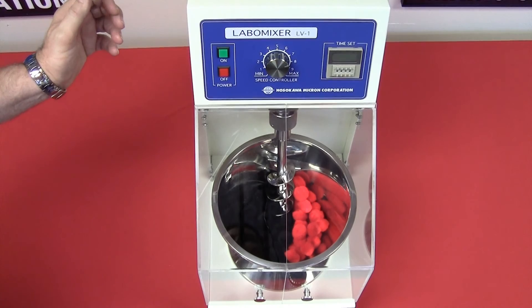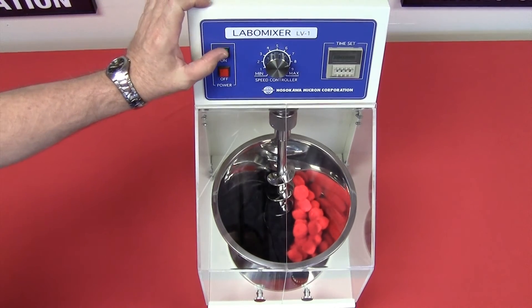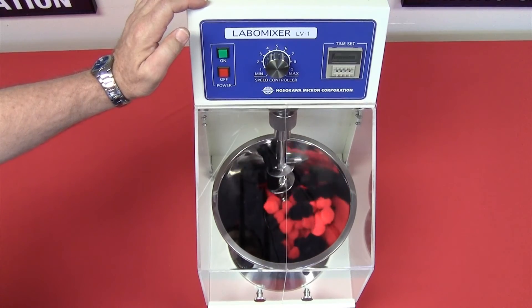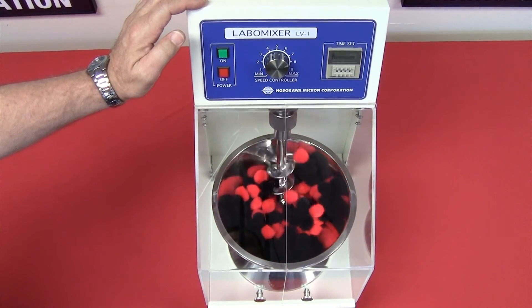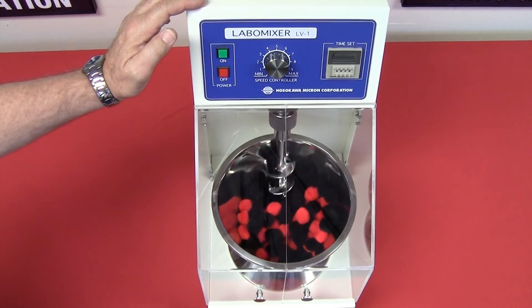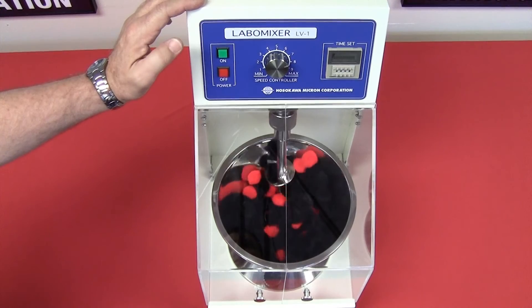Mixing with the Labomix is fast and efficient. The bowl starts the mixing — as you can see, the two products are now mixing to a homogeneous mixture, which, however, is product dependent.